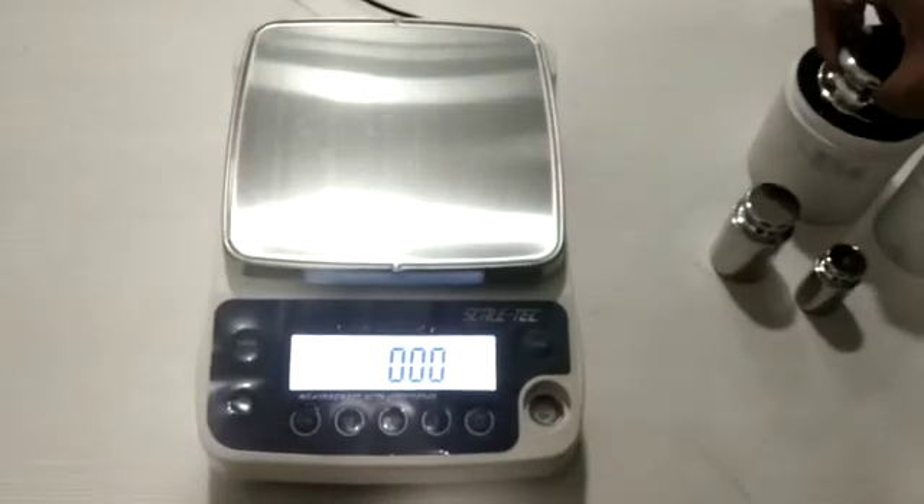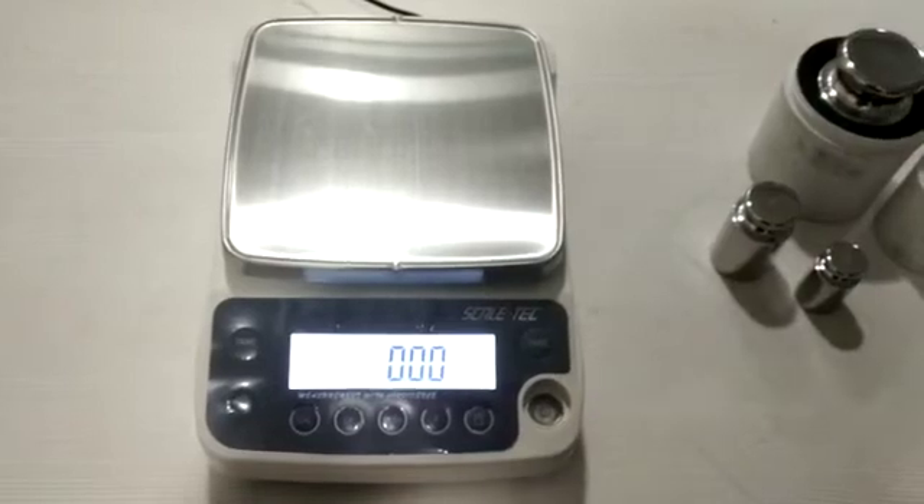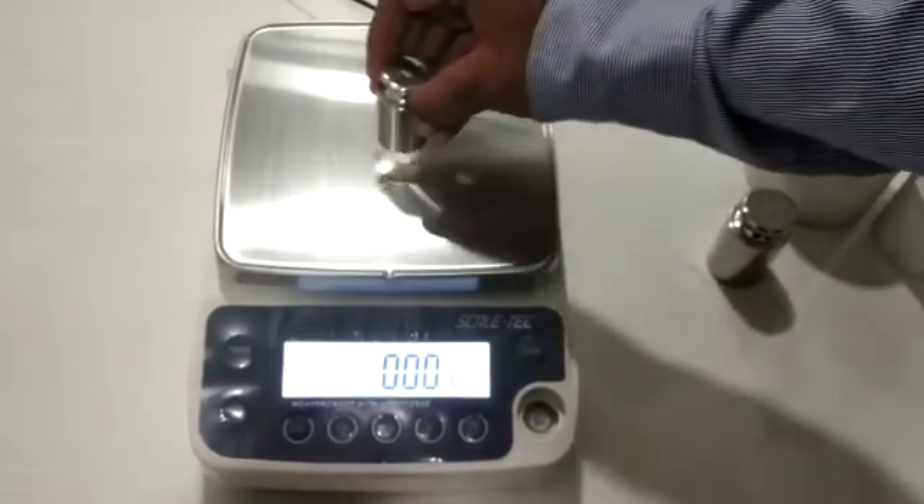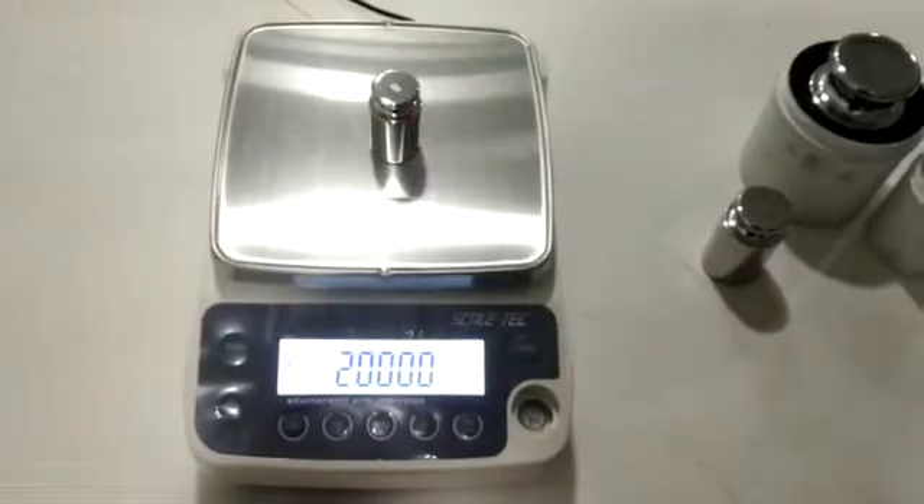Now the calibration is done. Pull out the weight and check the result on the machine. Now let us find the linearity.